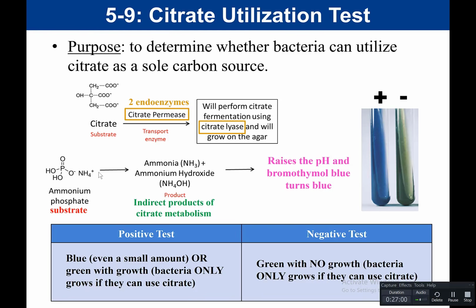Now again, in order for that to be meaningful, you also have to check that the cap was on loose, that you didn't screw the cap on too tight. Because if the cap was on too tight, right, then if air doesn't get in, the bacteria won't grow, and you would record that as a negative, but it's actually not. You just didn't do the experiment correctly.